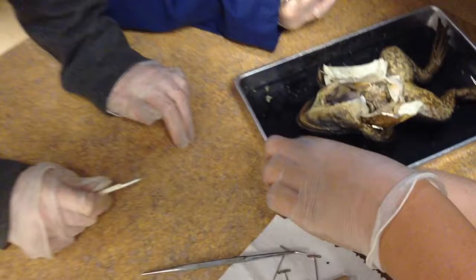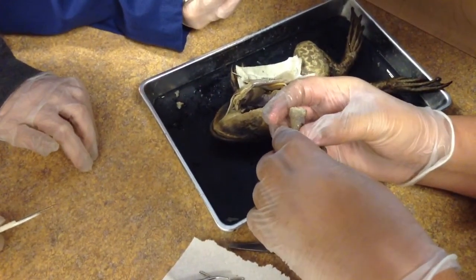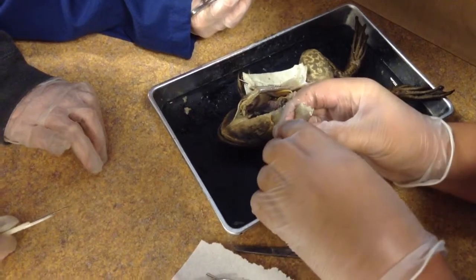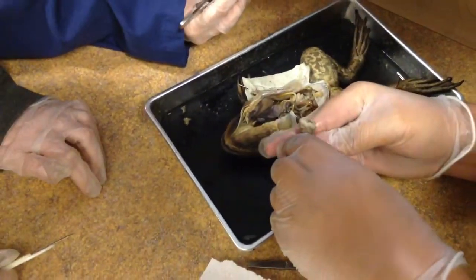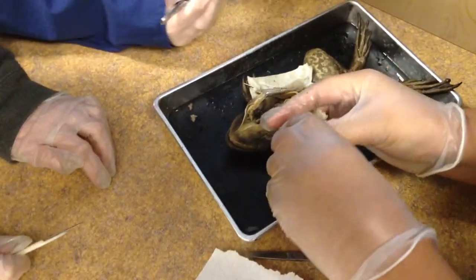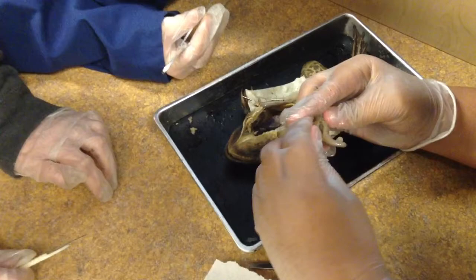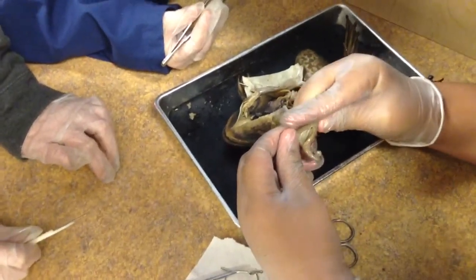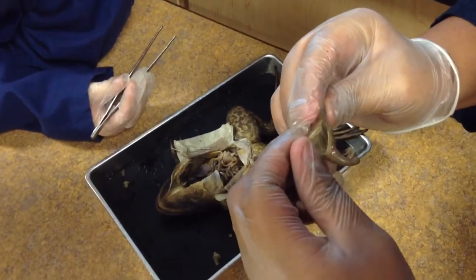Is the stomach open? Let's see. Do you guys see the rugae? The little folds in it? Just kind of peel it open. There you go, you got it. All right, let's look inside. Pull it up. Okay, so we see the rugae and the little folds.